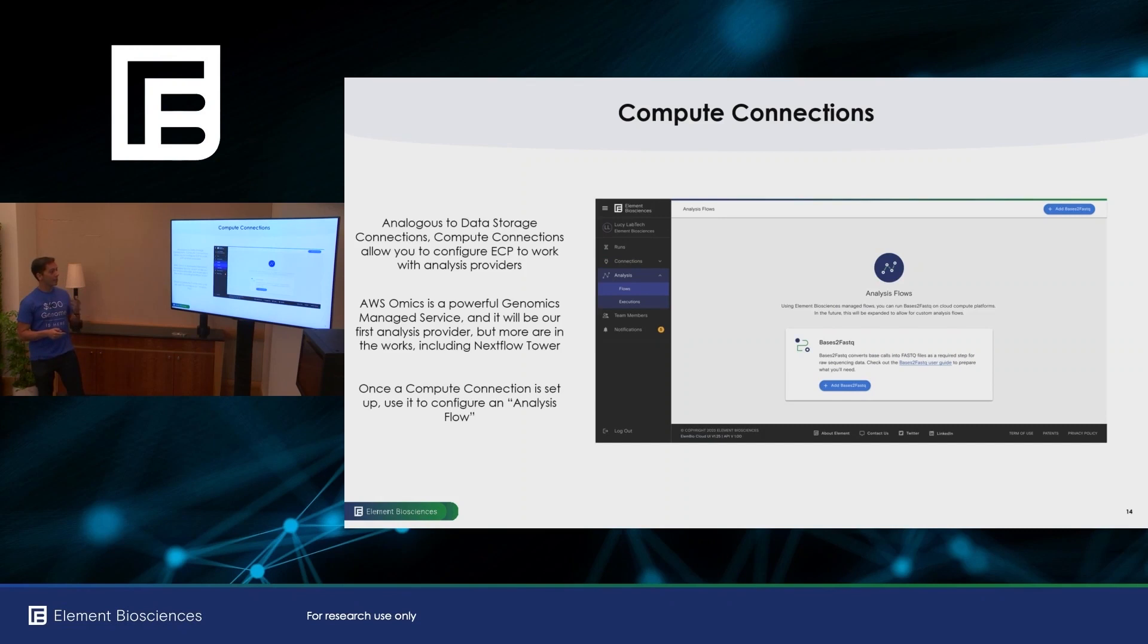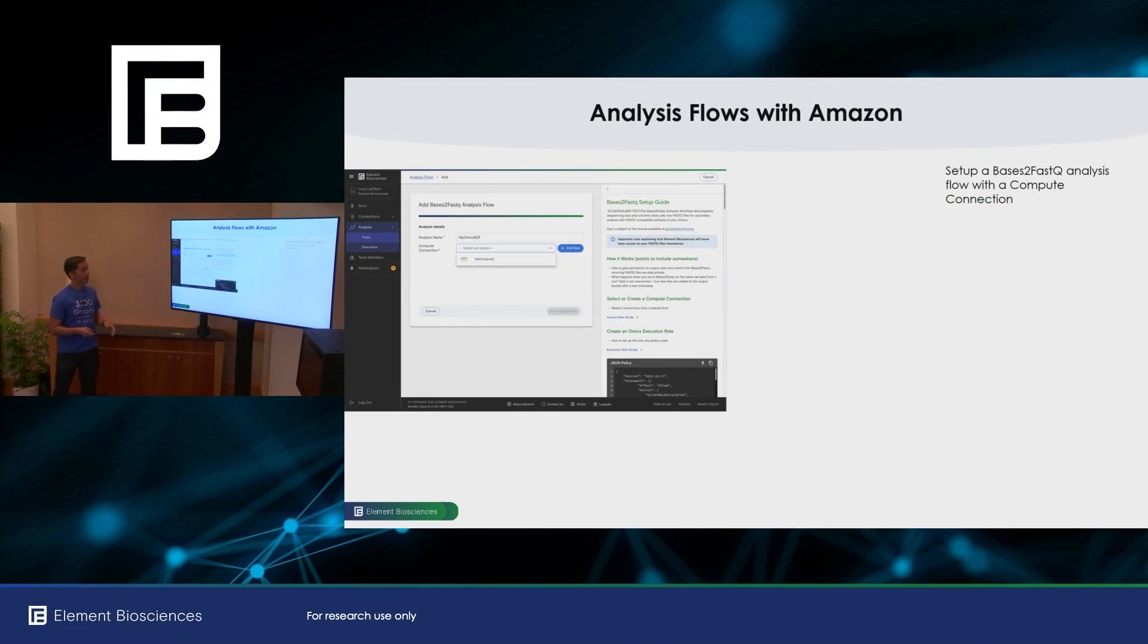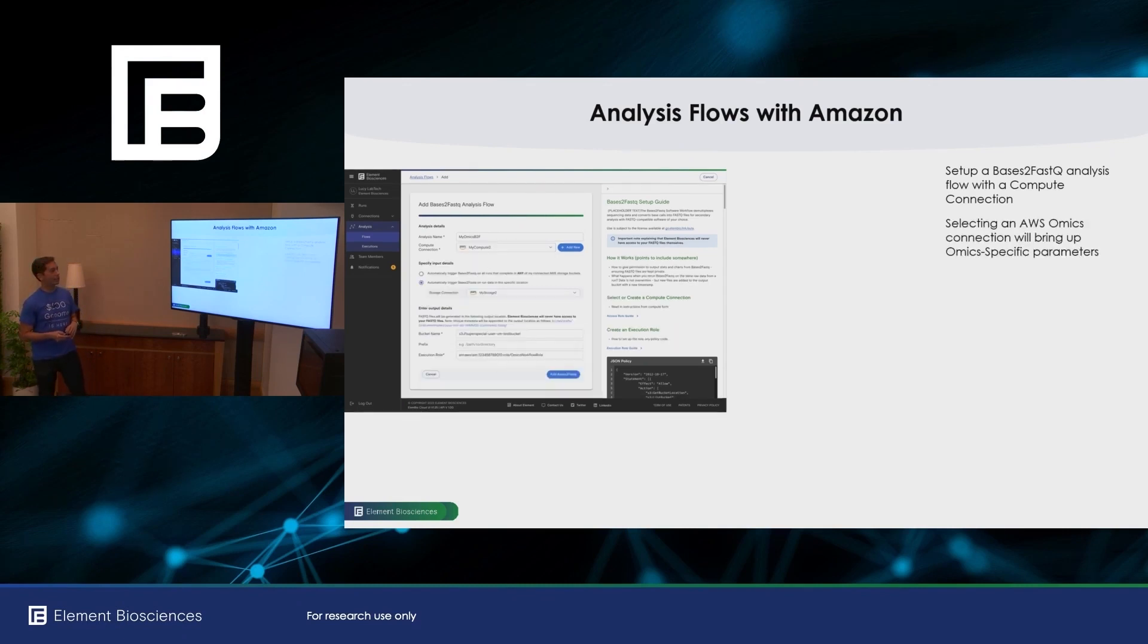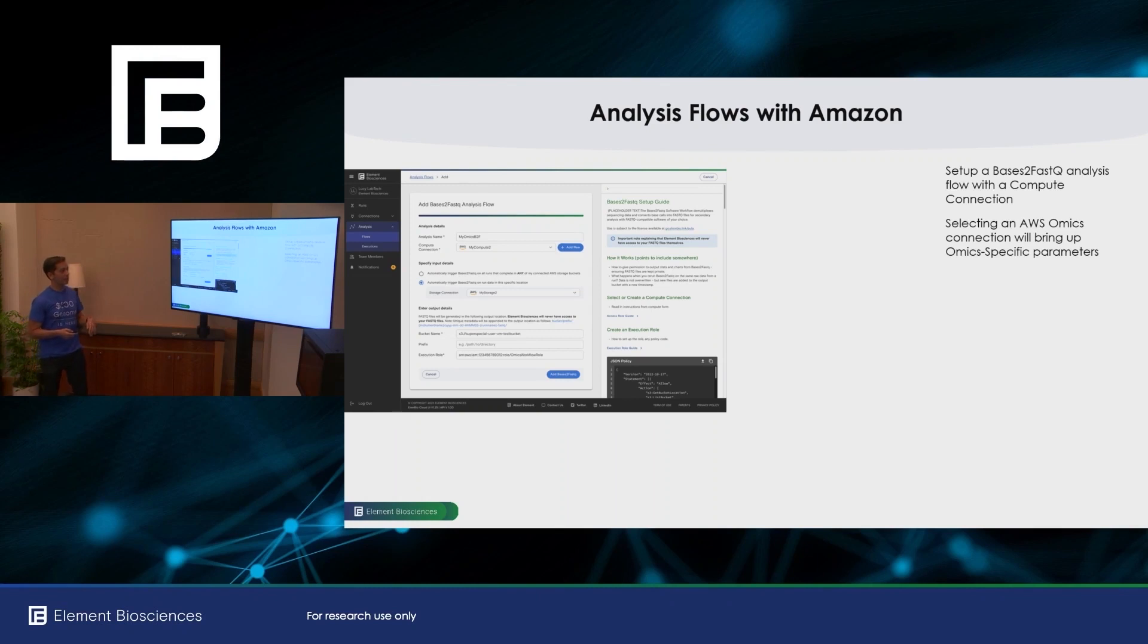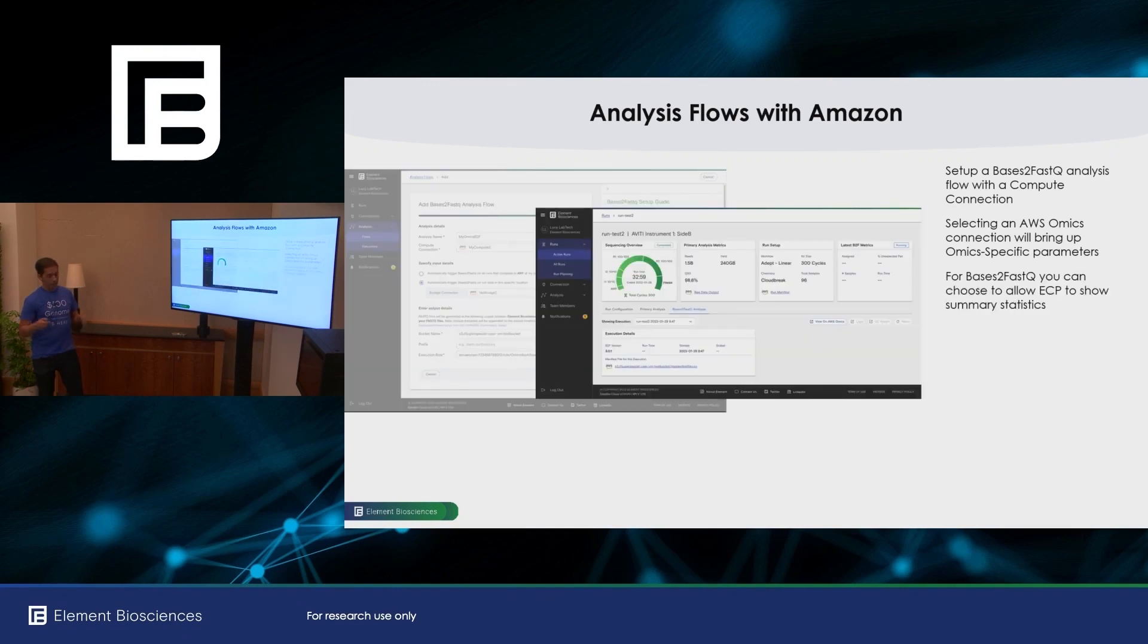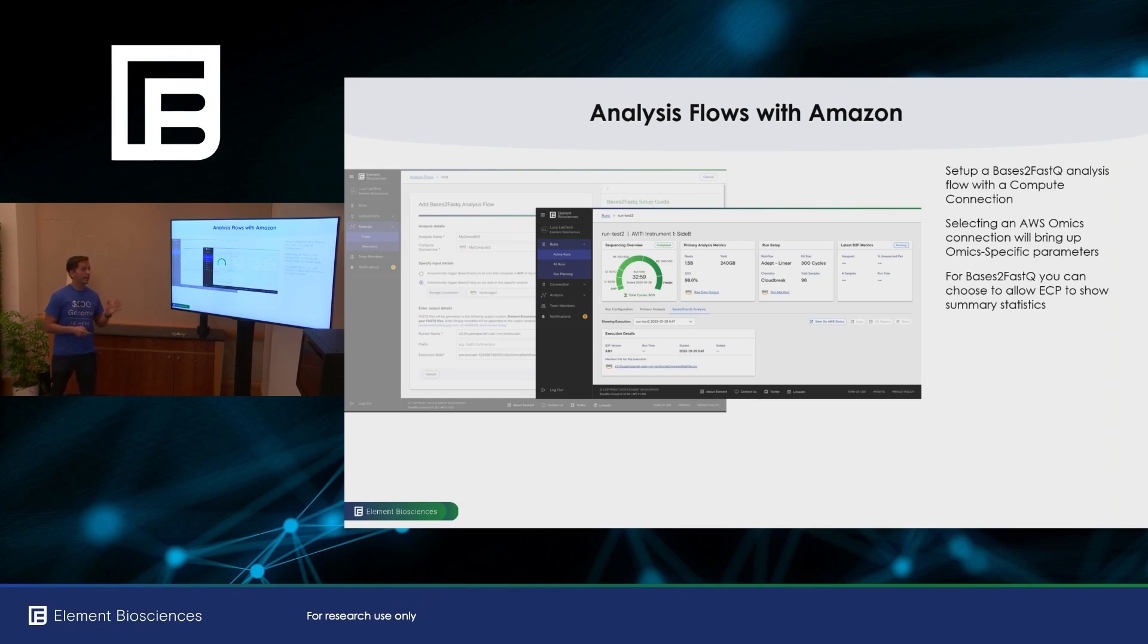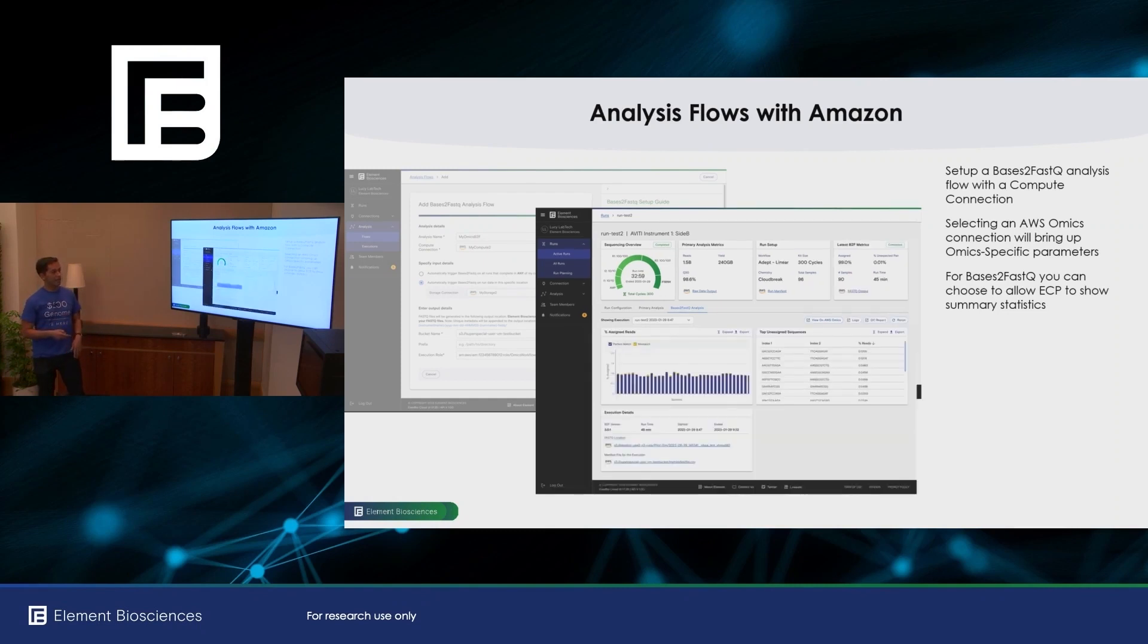So once the compute connection is set up, you can use it to configure what we call analysis flows. Our first analysis flow obviously will be bases to FASTQ. So here I can walk you through how you would set that up with AWS. So you set up a bases to FASTQ analysis flow, you would choose the AWS compute connection that will bring up the compute connection specific parameters that you need to enter for that analysis flow. Again, all of the instructions are visible on the right hand side of the screen. Then when all your data are ready, bases to FASTQ, this analysis flow will automatically launch.